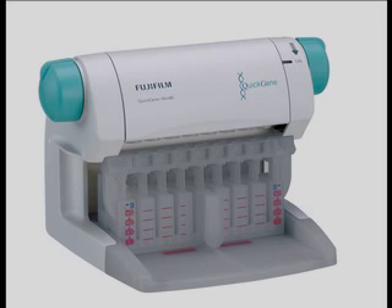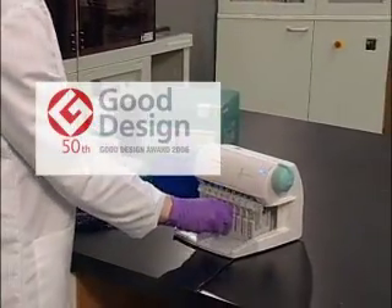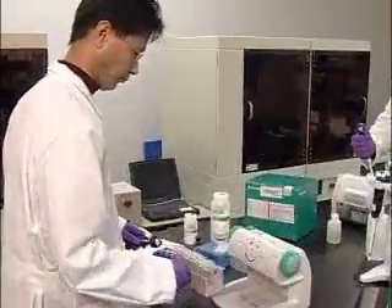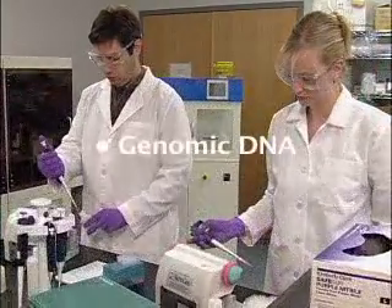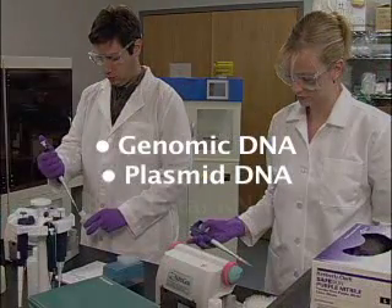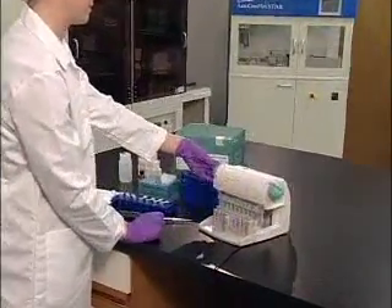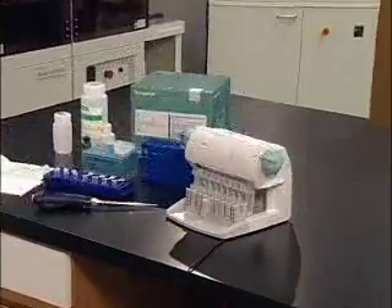The Quick Gene Mini 80 is the first personal nucleic acid extraction device, developed by Fujifilm Life Sciences, and it won the prestigious Good Design Award in 2006. The Quick Gene Mini 80 is intended for use on a researcher's lab bench to aid in the extraction of genomic DNA, plasmid DNA, or total RNA. Scientists who use the Mini 80 are typically interested in quantitative PCR, genotyping, cloning, and microarray work.